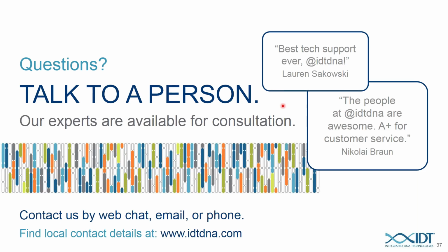This is a question that we do get from time to time. I'm not sure I've heard a recent answer for this, so it's good to be asking it again. Do we have any recommendations for people for applying RNP delivery in plant genome editing?